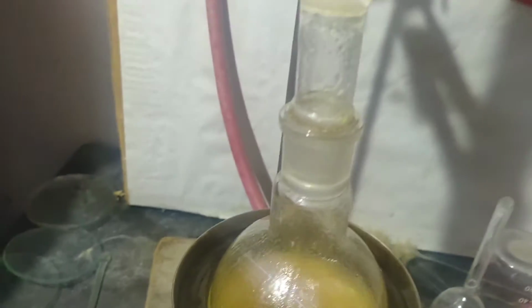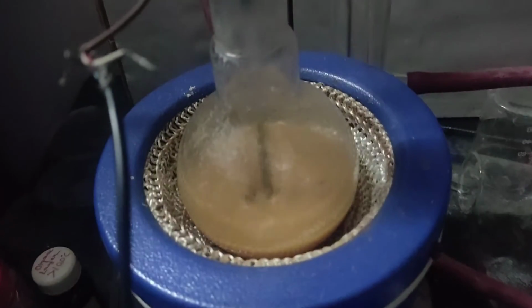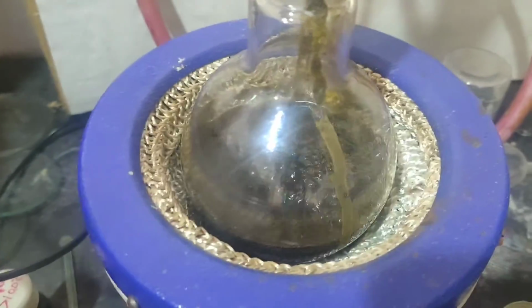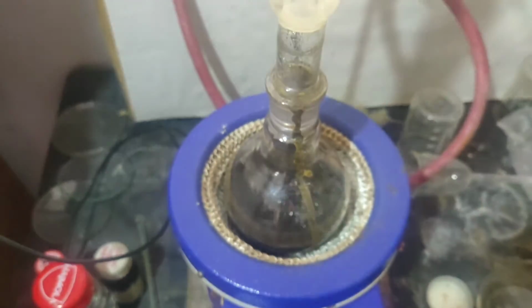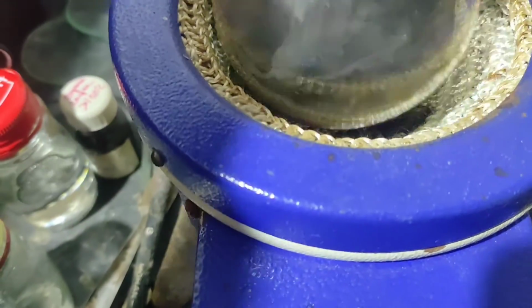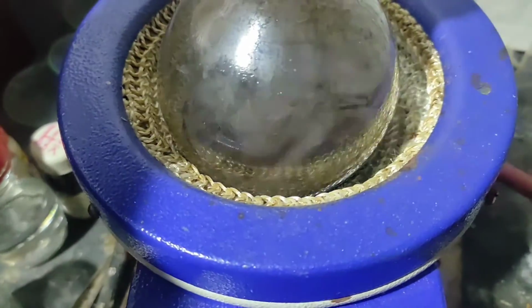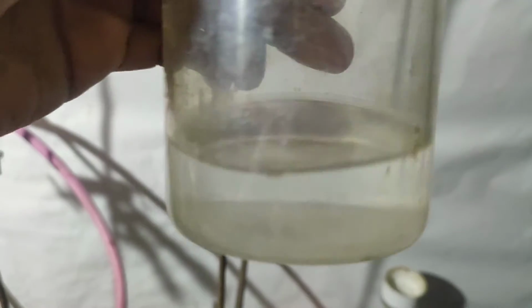So I set it again on a heating mantle and heated it such that it only boils a little bit, and stirred it with an overhead stirrer. Within 3 hours, the solution turned dark. Then I again put the condenser. For this reaction, I should have used a 3-neck flask so that I could place the overhead stirrer in one neck and the condenser in the other neck. Anyways, it was refluxed for another 1 hour and then steam distilled to take out any unreacted alpha nitronaphthalene.